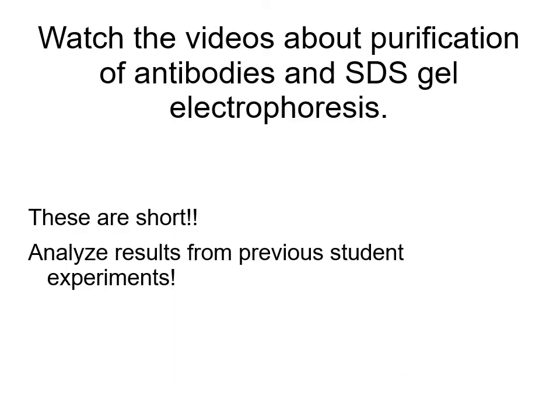Okay, so there's a couple of videos to watch about this. They're all very short. And for our lab itself, we will analyze the results from previous student experiments, along with answering a few questions about acrylamide gel in general.